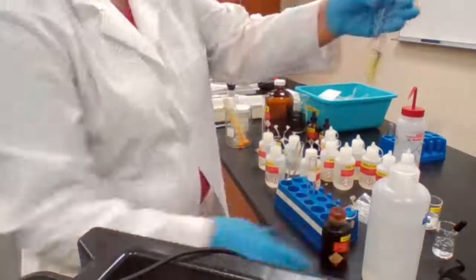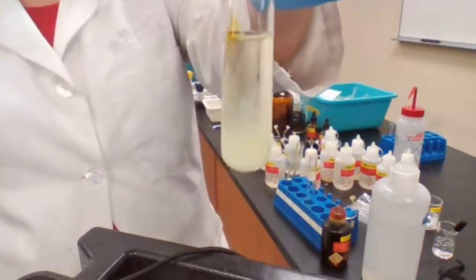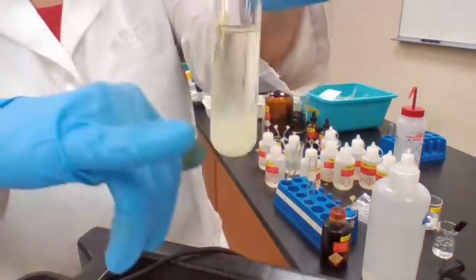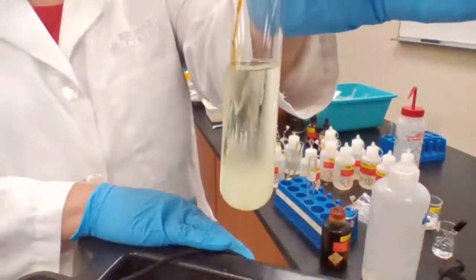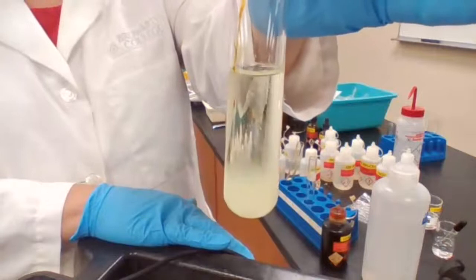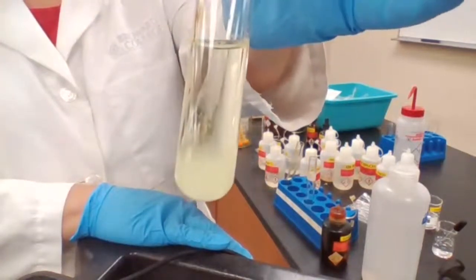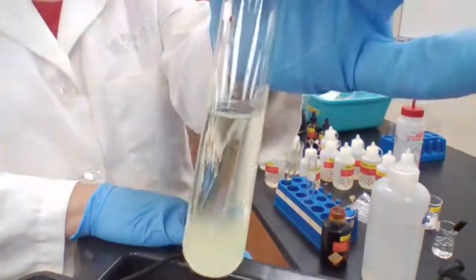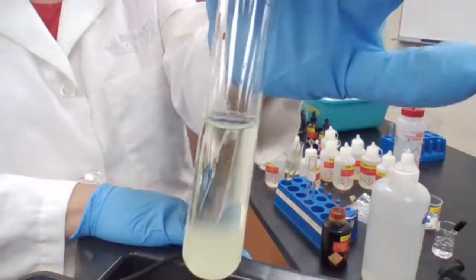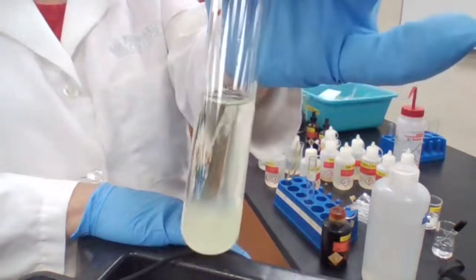Okay. Do you see this test tube? That's for the iodoform test. It turned cloudy. Is it clear that it's cloudy? Yes? Okay. You can take a screenshot of this. This is the proof for iodoform, and that was unknown C. Okay. That's the unknown C.